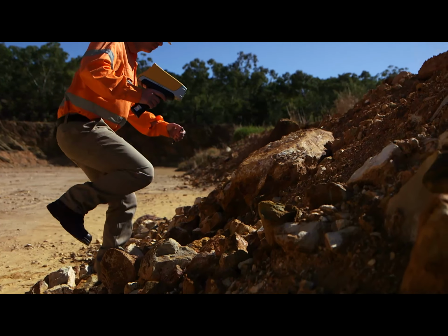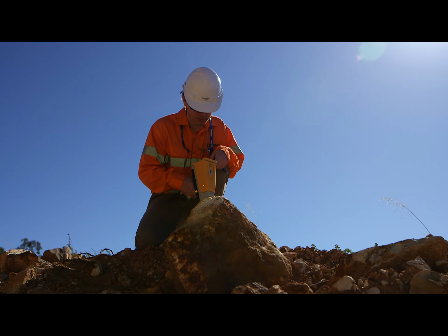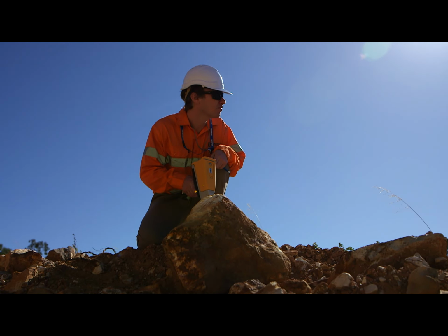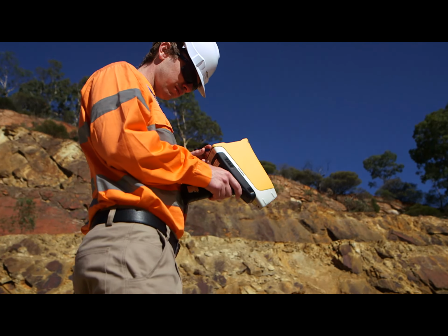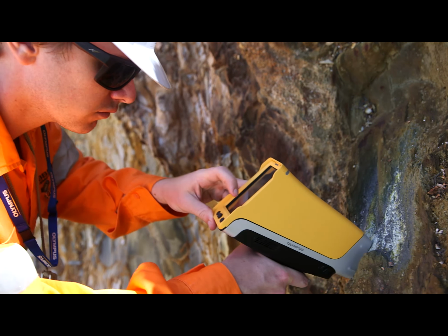It's mainly in relation to precision and lower limits of detection. It's all about statistics. The X-ray is gathering hundreds of thousands of points of information per second. Thus, for some users, a shorter testing time might be applicable, and for others, a longer testing time might be needed. Light elements, magnesium, aluminium and silica, are harder to measure, aren't they, because they fluoresce more weakly than the heavier elements? That's right, Dr. Todd. The elements, particularly magnesium, aluminium, silica, in my experience, with a lower atomic number, we need a longer testing time to test at or near the limit of detection for our analyzer.